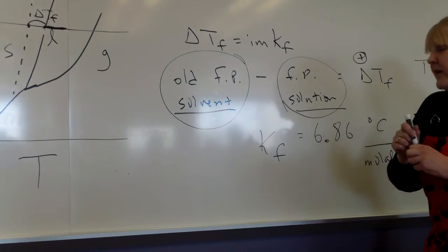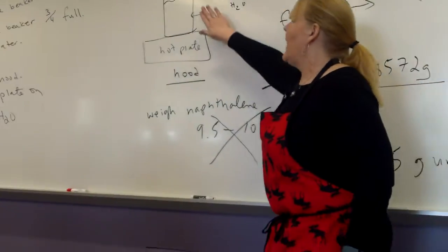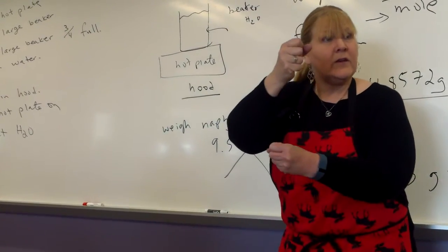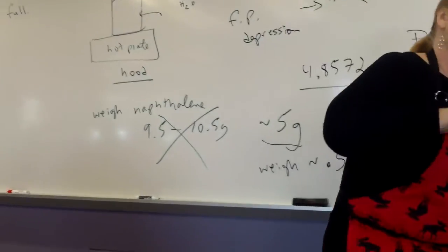The setup is straightforward. You have your beaker and your hot plate. The only other couple of things you need is a ring stand, a clip, and what we call a gas bottle. So, if you come over here, I'll show you what we're going to do.